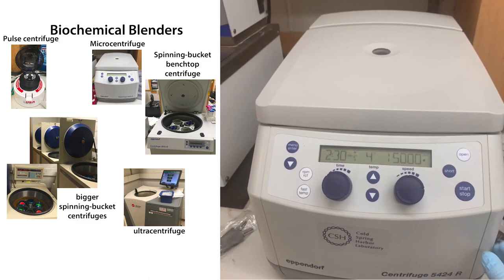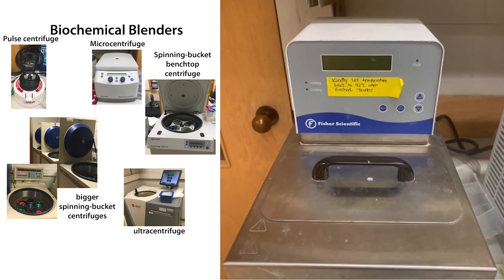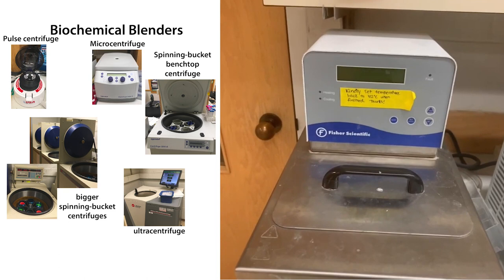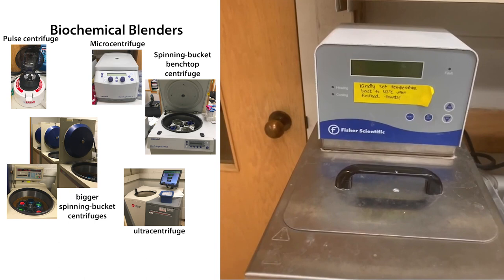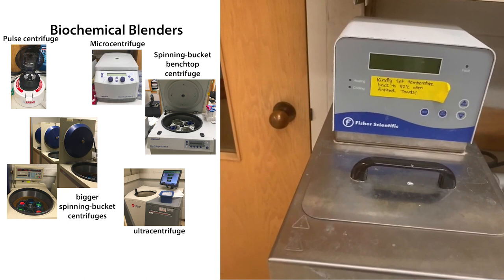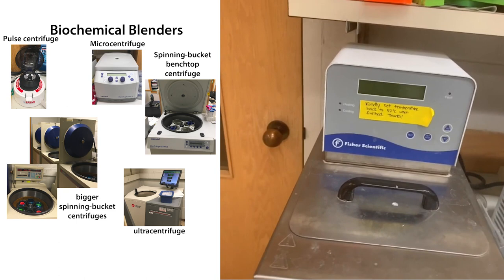This is our water bath. We use it a lot for thawing cell pellets and doing transformations — heat-shocking bacteria to get them to take in a plasmid. It's at the end of my bench, so I often think people are coming to see me when really they're just coming to do transformations. The water bath also makes really loud growling noises when it's running low on water — so if you hear that, fill the water so that people don't go crazy.